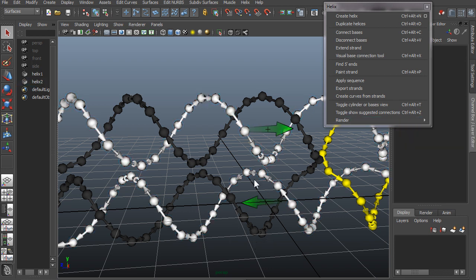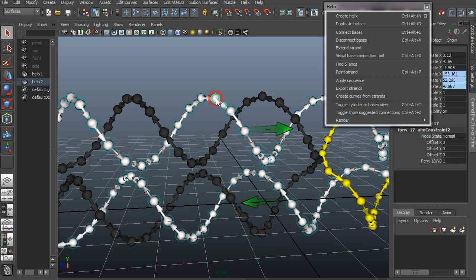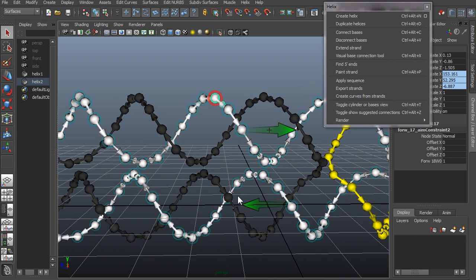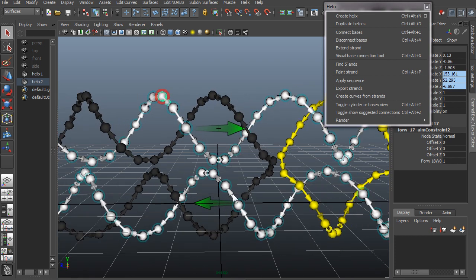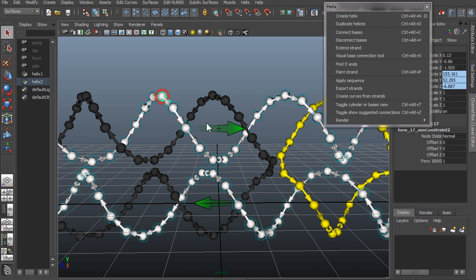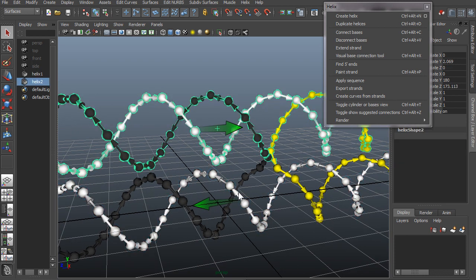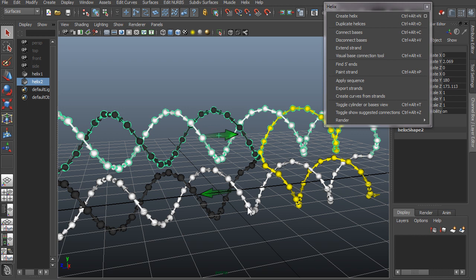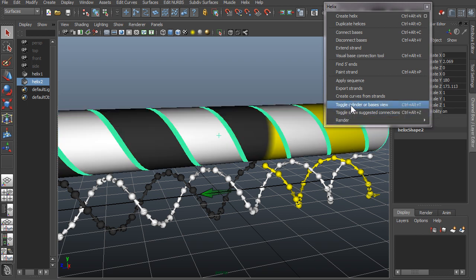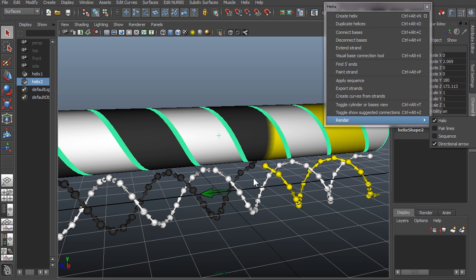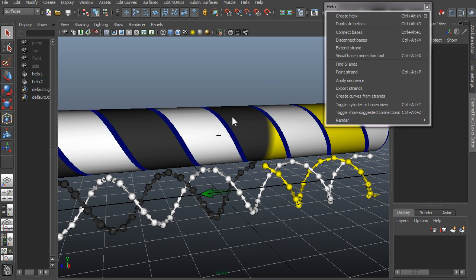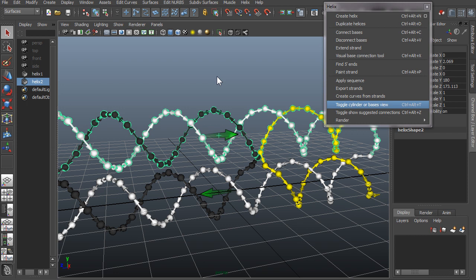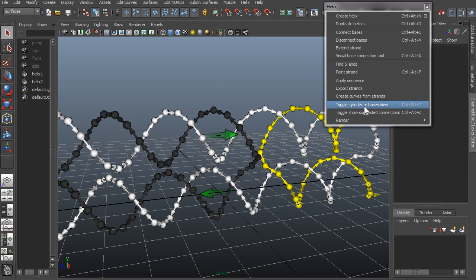Let's keep it like this for a while. Another thing is that if you're working on a big model, you might not want to show everything as individual bases, as that can reduce the performance when you're working in the viewport. In that case you can mask some of your DNA by going to toggle cylinder or basis view. In this case I had one of my strands selected and then I pressed toggle basis or cylinder view.